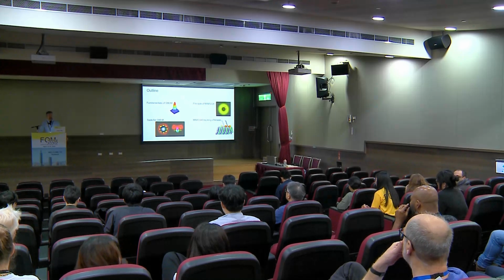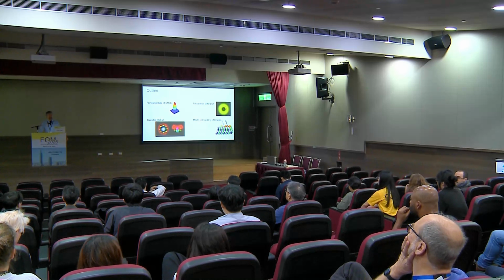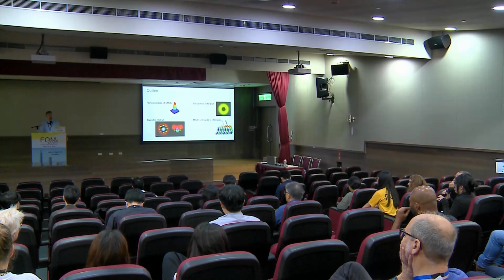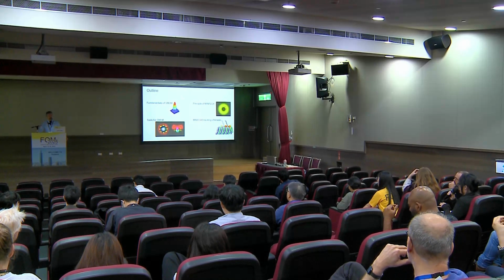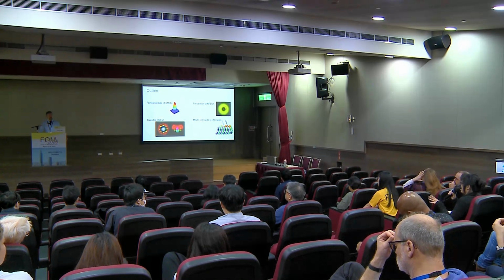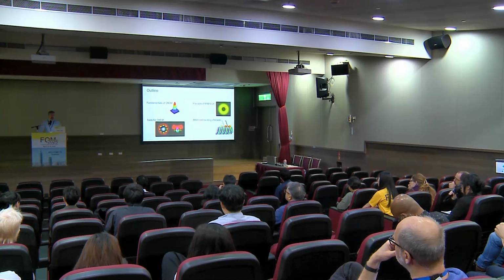They customize for different companies, and you can input what lenses you use and what the numerical aperture is. But for the detail, I don't know, they have done quite good Z resolution. And I also see you have done quite good results. So I just wonder, have you done some kind of benchmark comparing your method with these, and how many parameters do you actually need as input for your software?